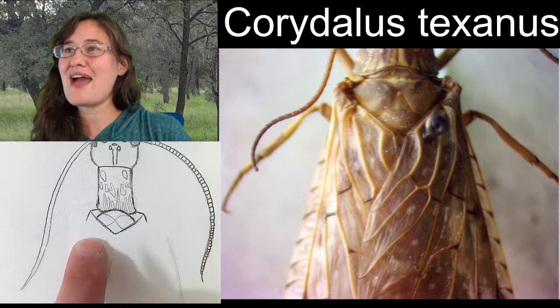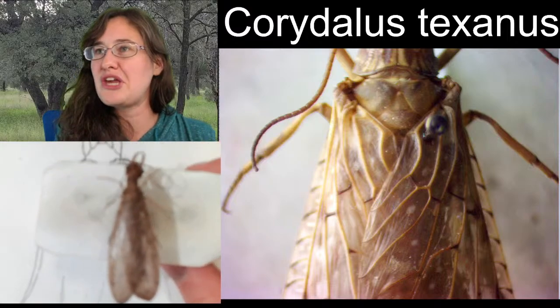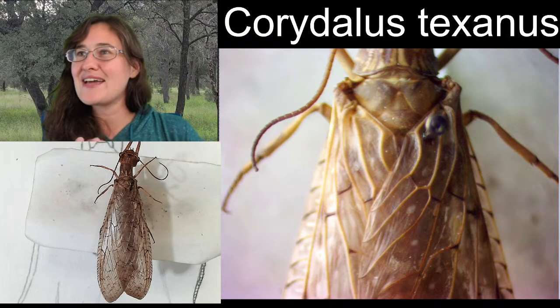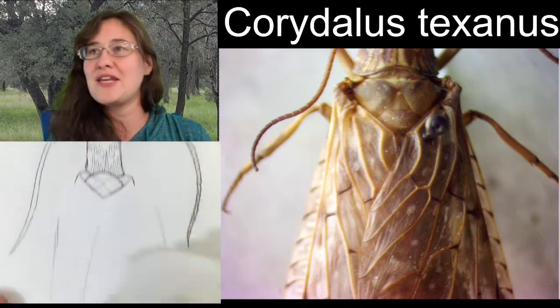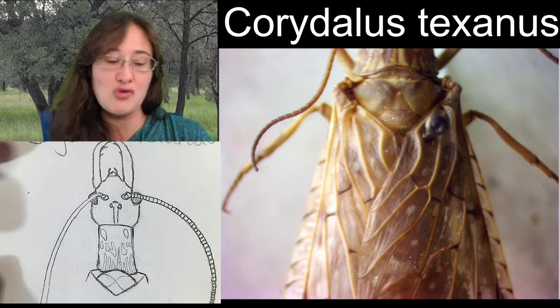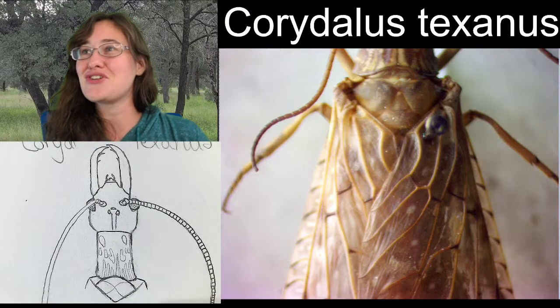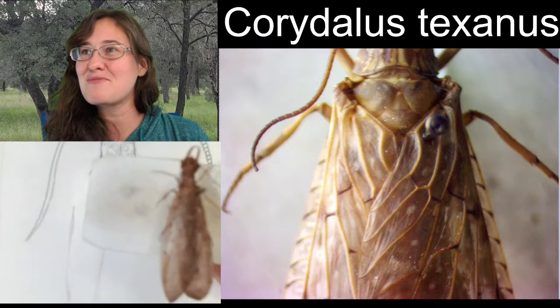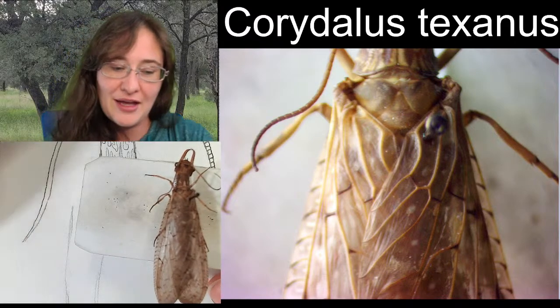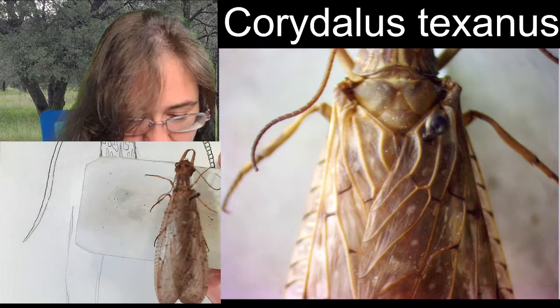All right, we have our scutellum taken care of. I'm going to be pulling our specimen over here because I did not get the ideal outline of my wings when we were doing our first sketch. And now that I've got so much of my Dobsonfly figured out from the front, I really want to make sure that these wings are just as impressive as the front of its body. So let's see about what I can do to fix this.